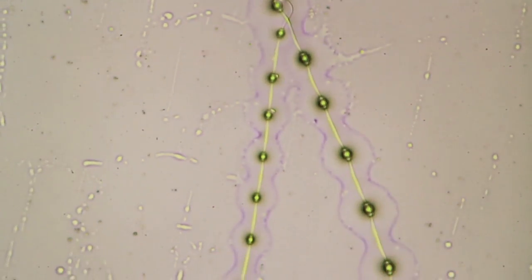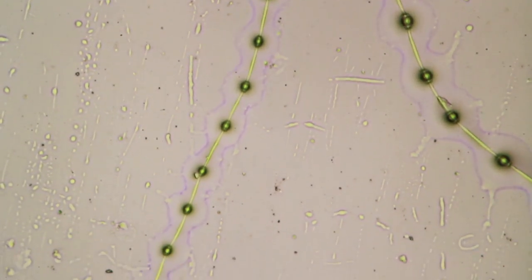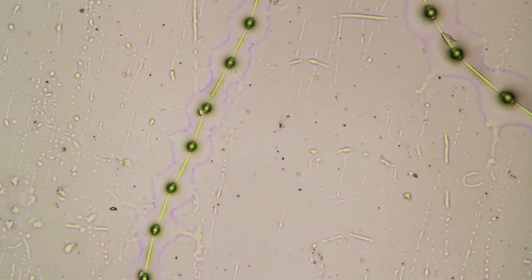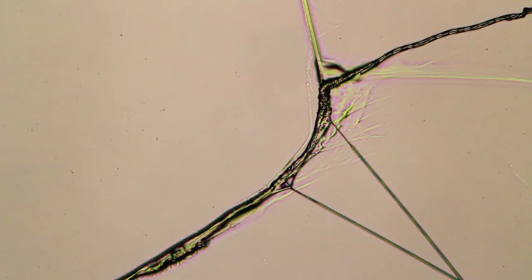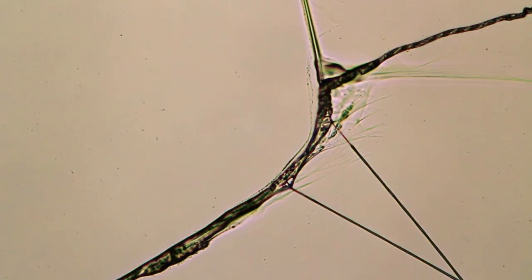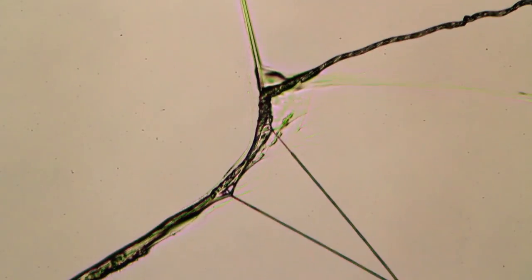The spilled glue makes the glue droplets appear like having a halo. The slide, I have to admit, has not been cleaned either - there's a lot of dirt on here as well. Here a little bit more close-up, a place where different threads are glued together. You can see that some of the glue has also spilled on the microscope slide, so there are these streaks here, especially well visible on the right side.